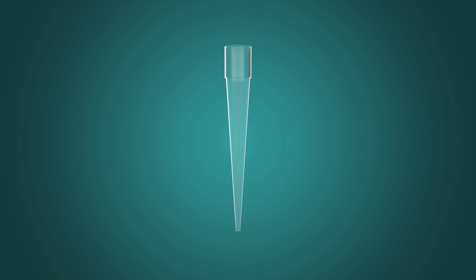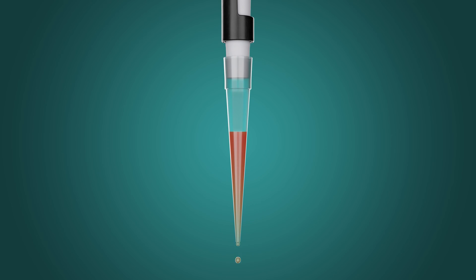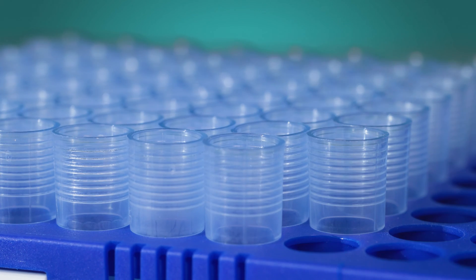All pipette tips are made from polypropylene. Polypropylene has a memory effect and wants to move back to its original shape. This is why most tips eventually loosen, leak, or fall off. As a result, users must hammer their tips into the pipette just to ensure they are secure to avoid these issues.